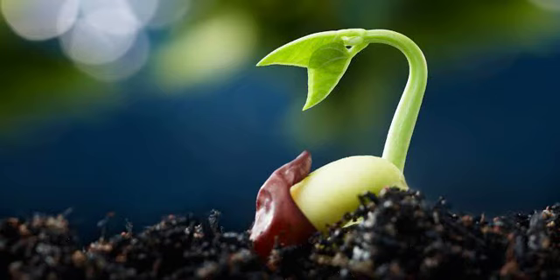Normal seedling: a seedling is considered normal when it has the capacity of continued development into a normal plant. It possesses all the essential structures: a well developed root system, an intact plumule with a well developed green leaf, and a well developed and intact hypocotyl.